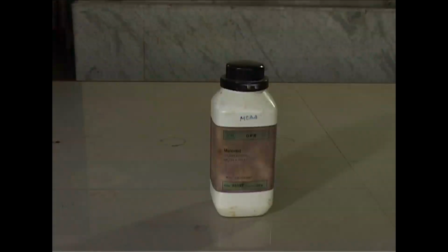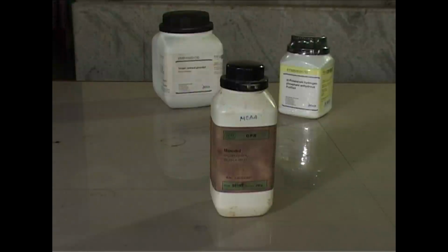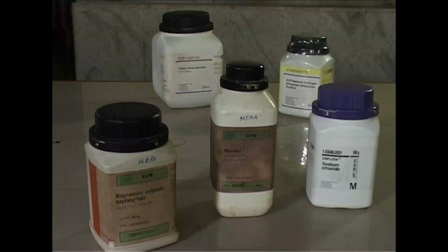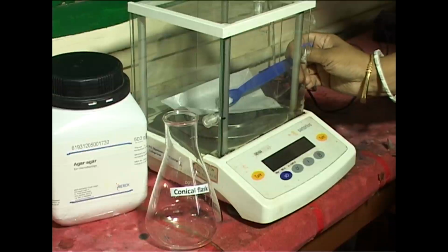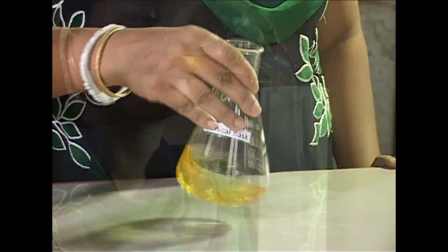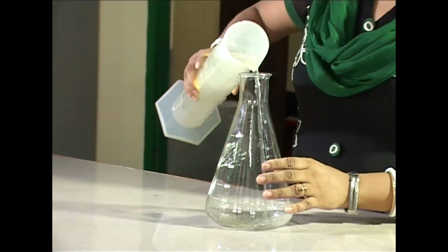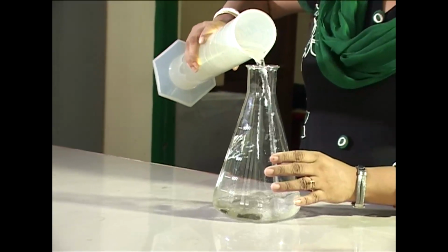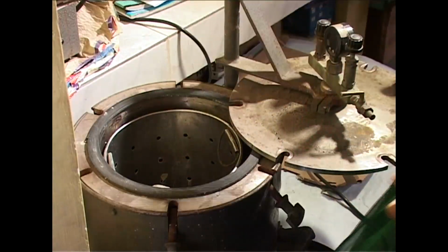First, we will prepare the medium. This is the composition of the medium, where we have mannitol, dipotassium hydrogen phosphate, yeast extract, magnesium sulfate and NaCl. Obviously agar, because we are using a solid medium. We will measure these in the typical composition mentioned here, then dispense it into a flask, make it up to 1 liter and then autoclave for 15 minutes at 15 pounds per square inch pressure.